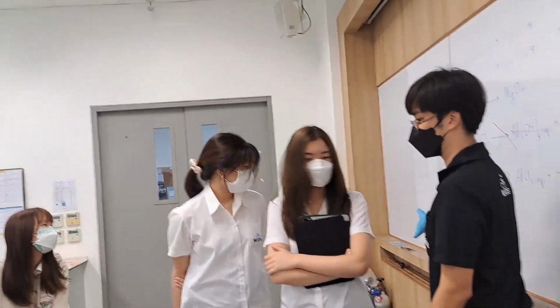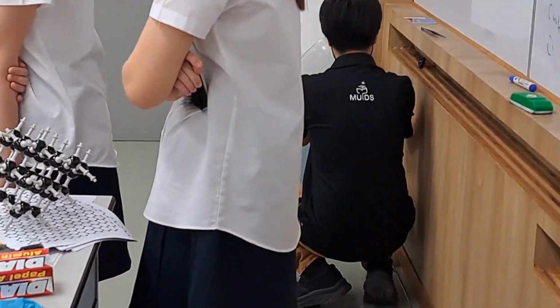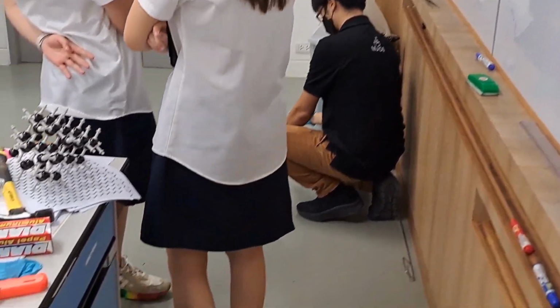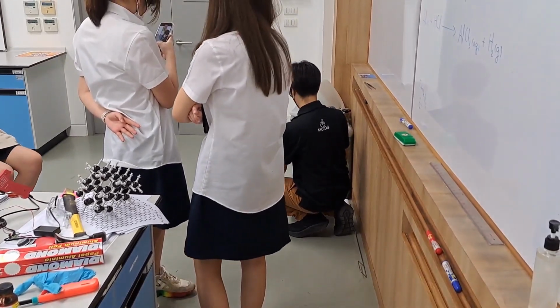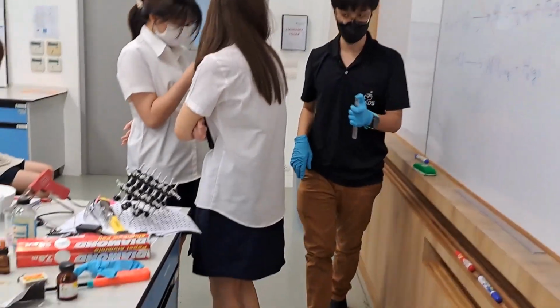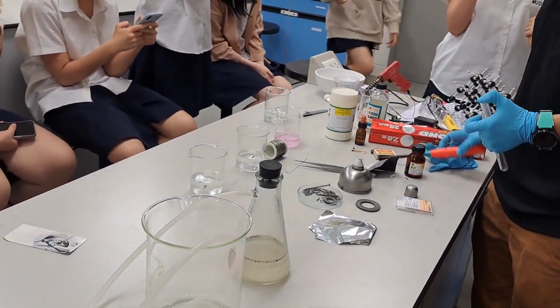So I have here a glass test tube, and this is the oxygen tank. I will turn it on and give the oxygen inside the tube. Okay, so this tube has the oxygen gas.